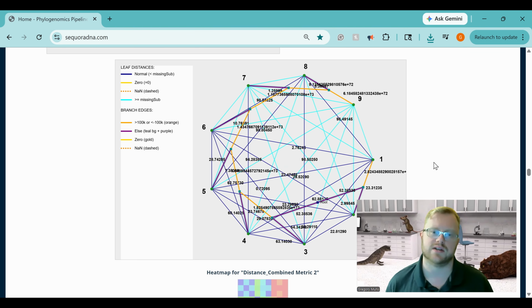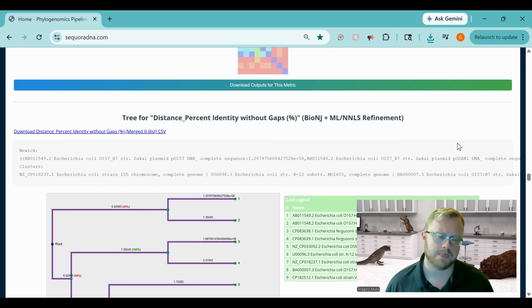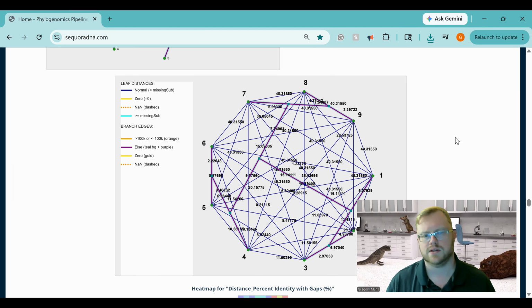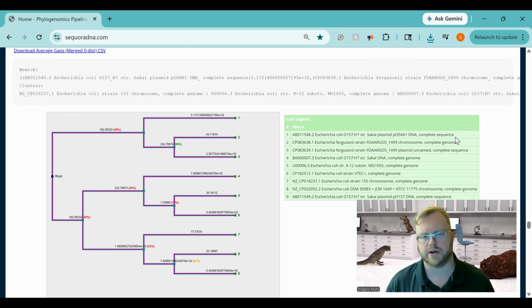Not just one tree, not just a few trees, you get a whole bunch of trees. As you scroll through this, you will see a whole bunch of different trees here. And since this is more of a map of similarity, that already opens up a bunch of questions. Of course, what do we mean by similarity?